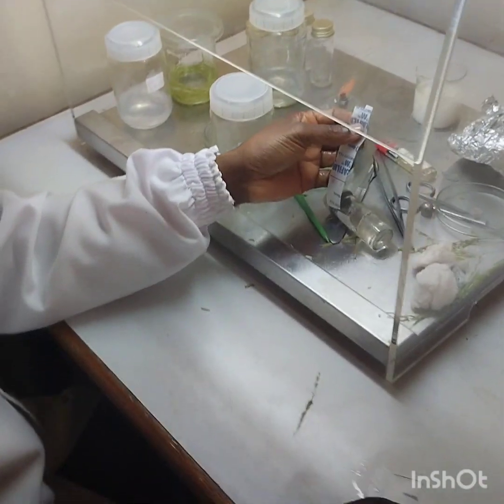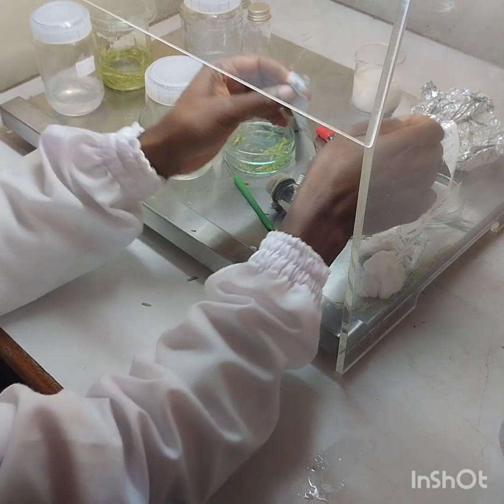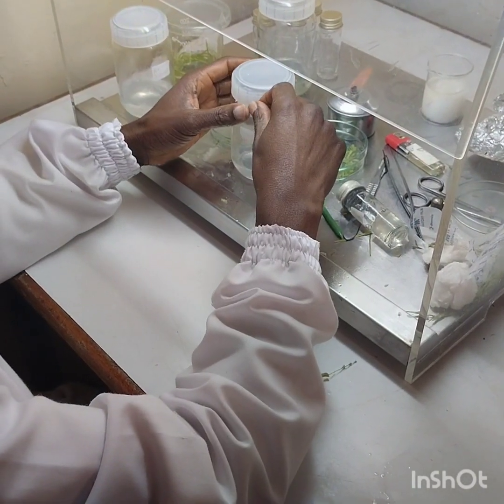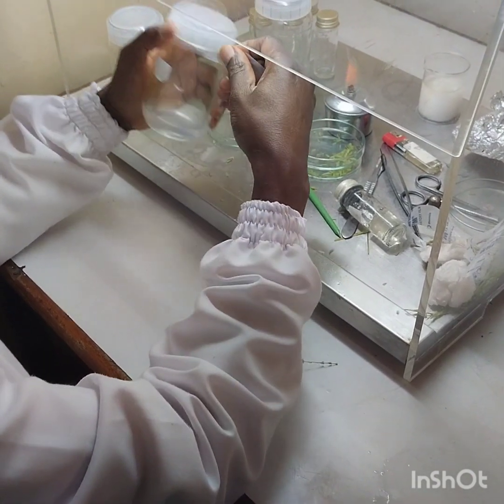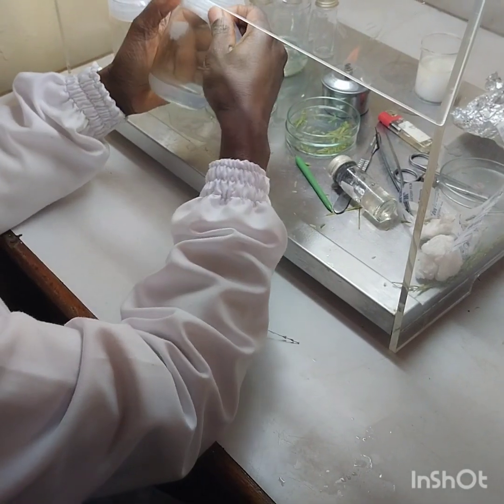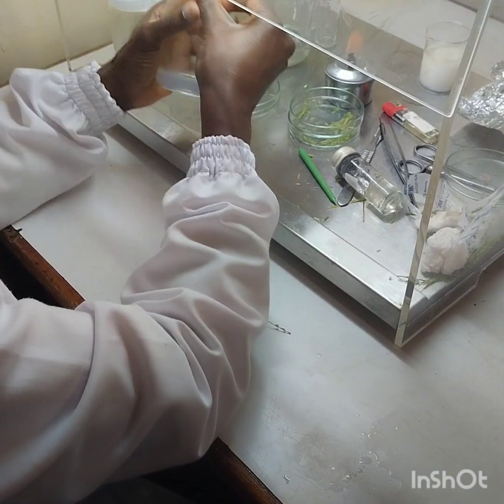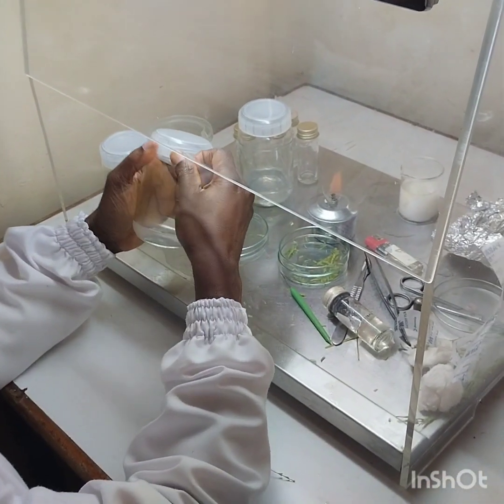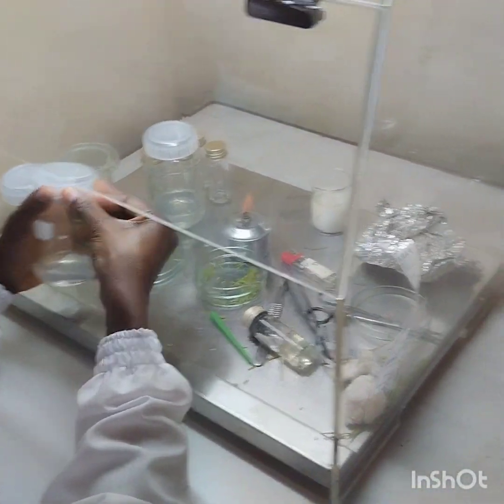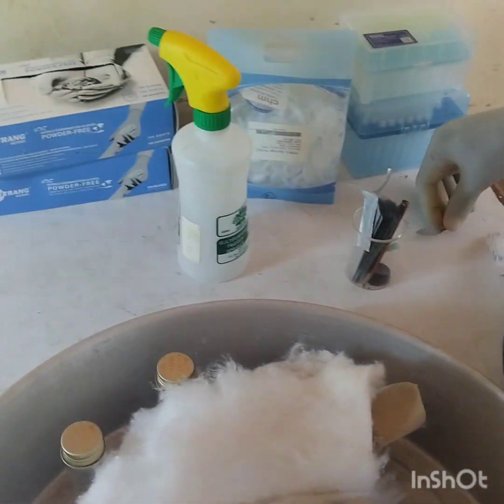Let's get started. This is to be cut inside — cutting outside contributes to contamination. You cut around, then you cut inside, because you know the inside is sterile.